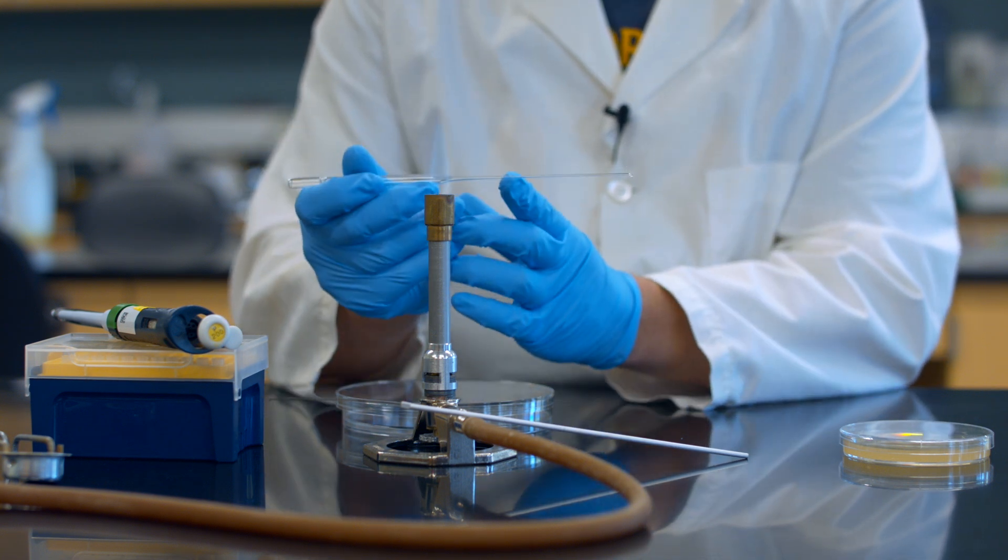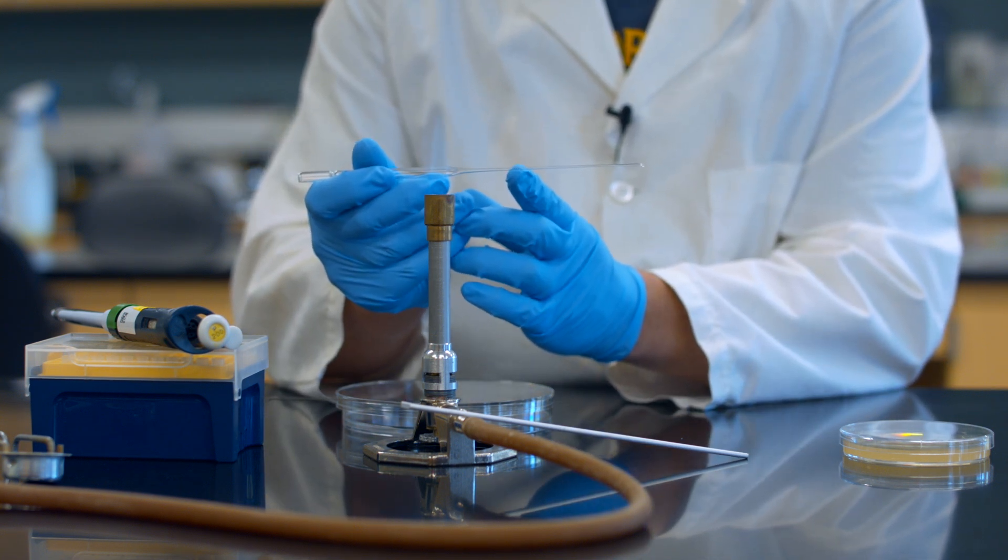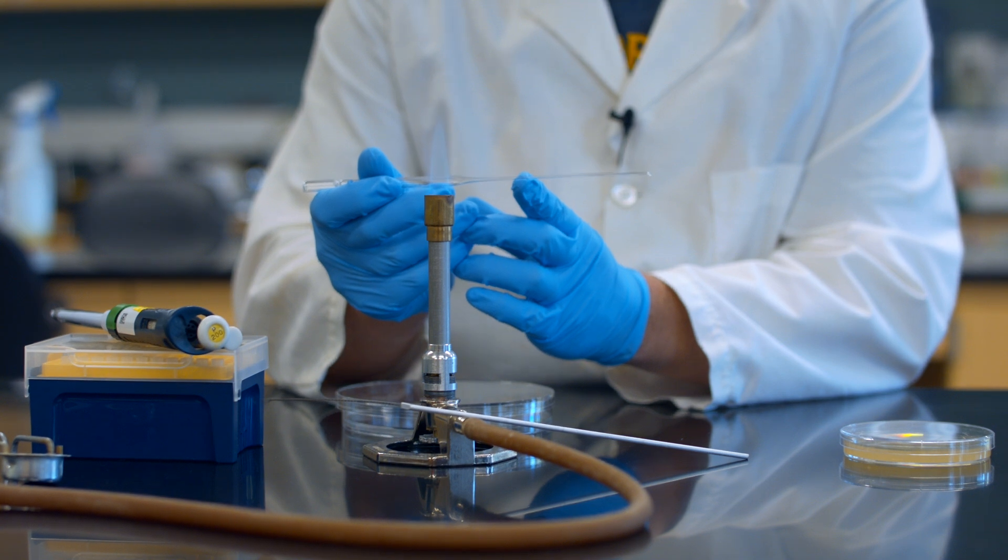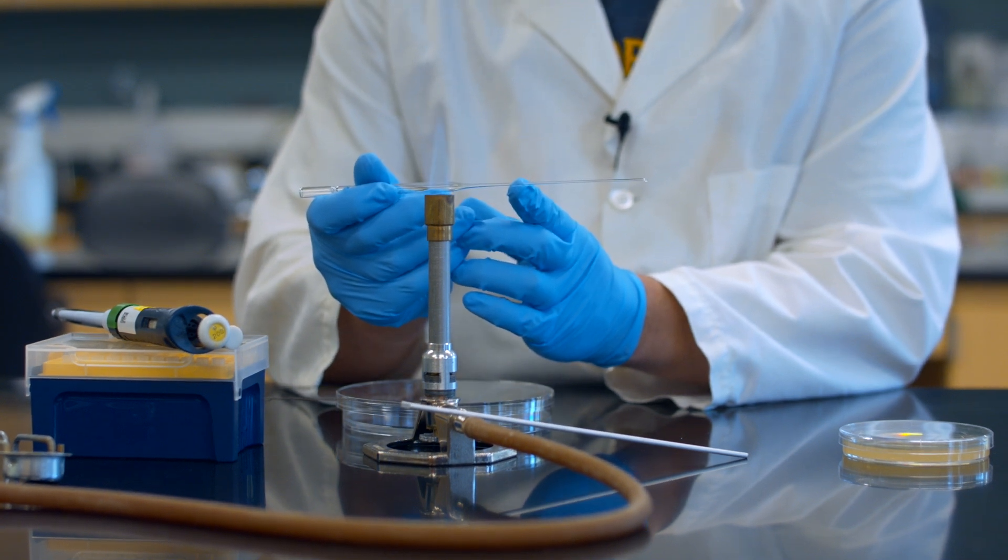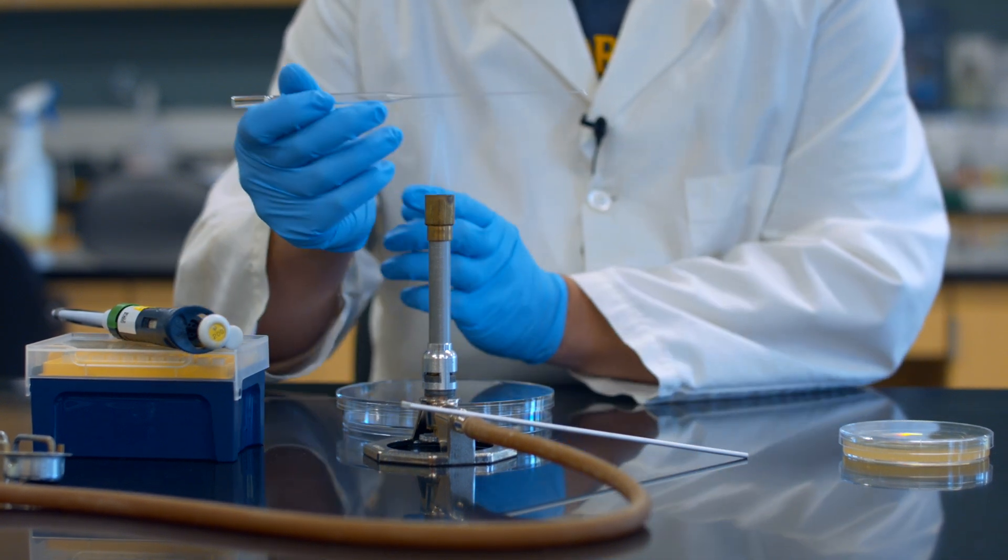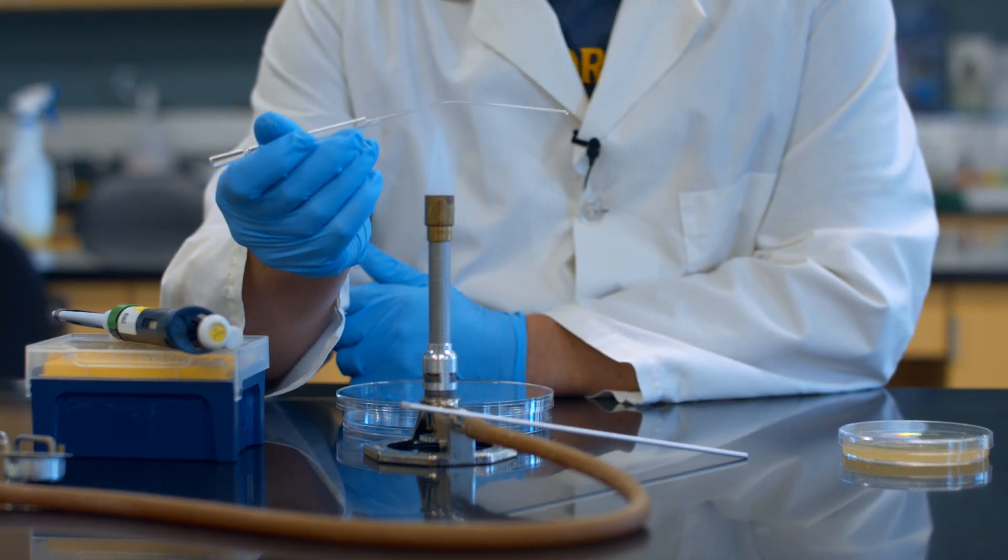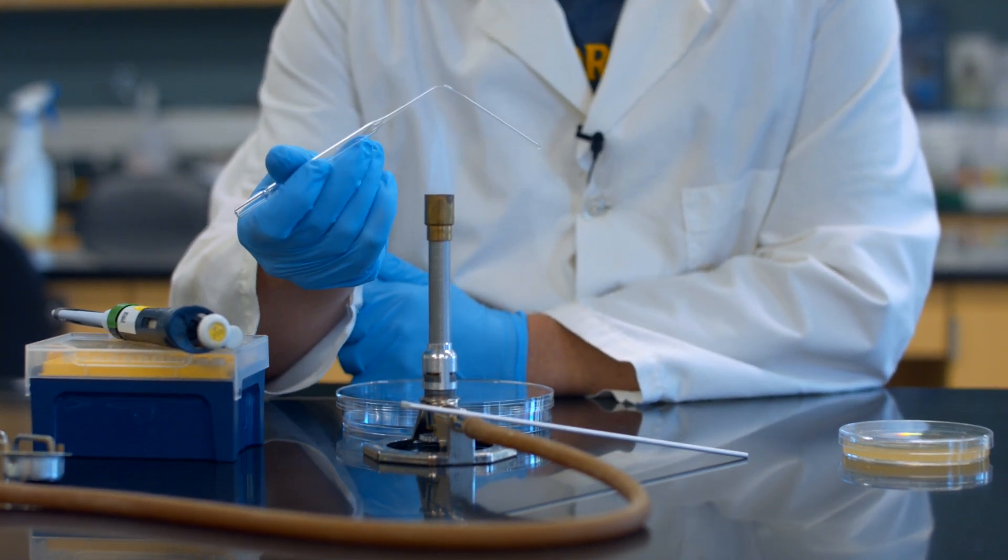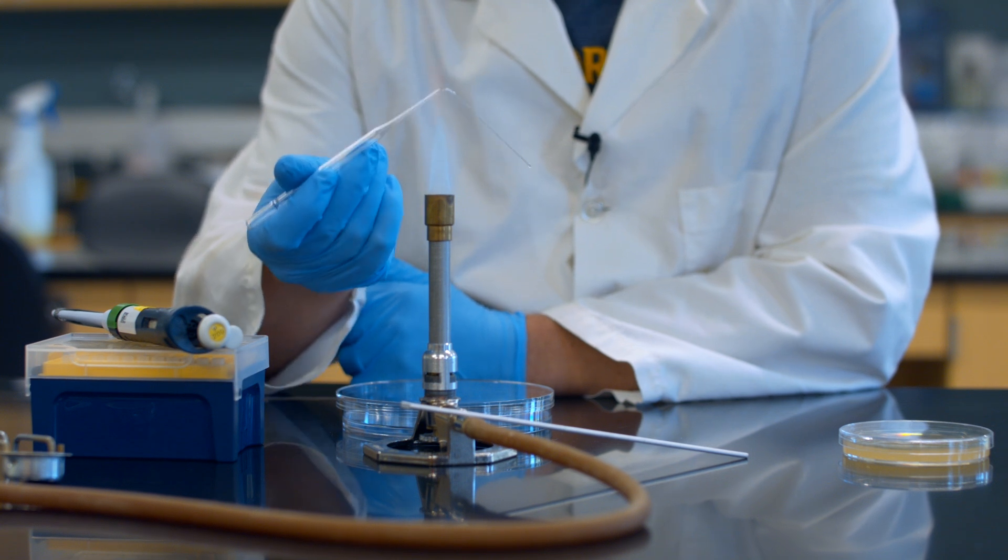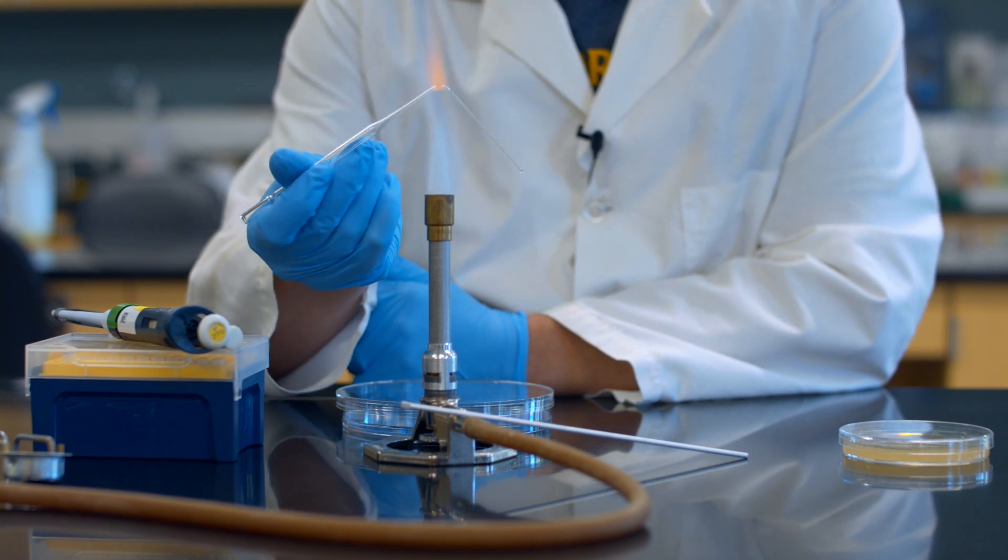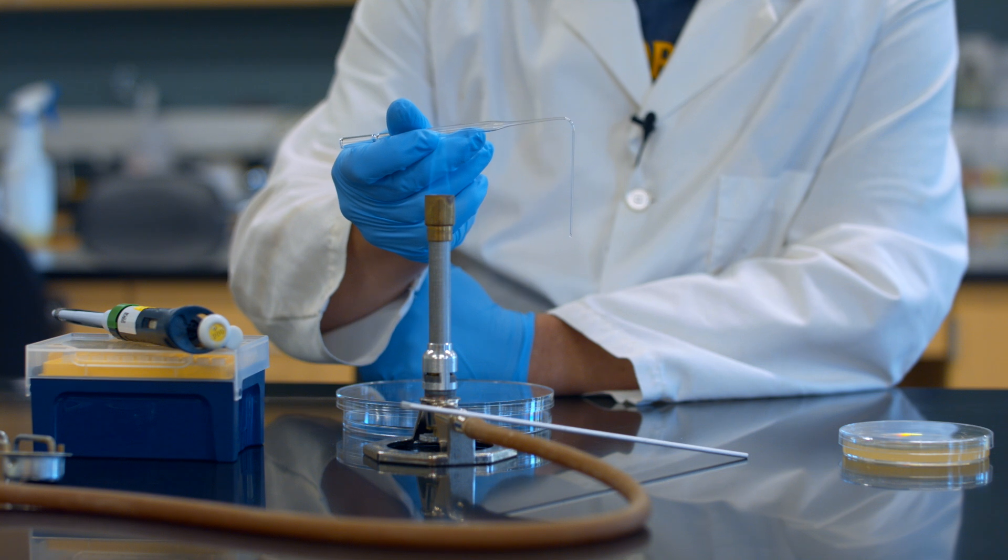And now I'm going to put a bend right about here, about two, two and a half inches down the length of this glass Pasteur pipette. Because it's so thin and this flame is so hot, you've got to be real careful. I want to go for about a 90 degree bend, just like that.